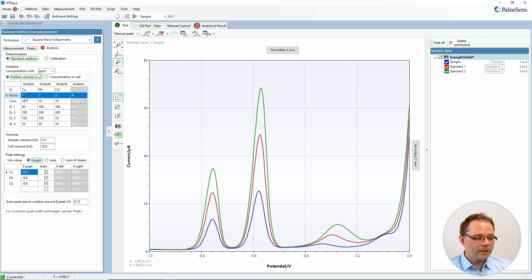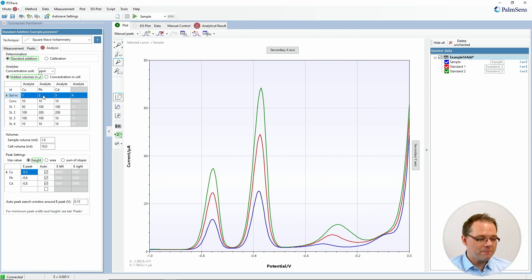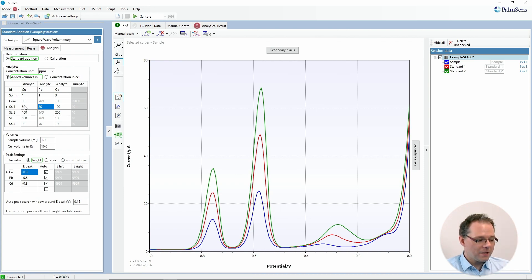The next line tells you if you use the same or different solutions. For example, do you have a mixed copper-lead standard solution, or do you have three different solutions — one for copper, one for lead, and one for cadmium? If you had a mixed copper-lead solution, you would change this to a one for both, meaning they both come from solution number one. That also means you can only add the same volume of that shared solution, though you can set different concentrations per analyte. Same number means same solution.